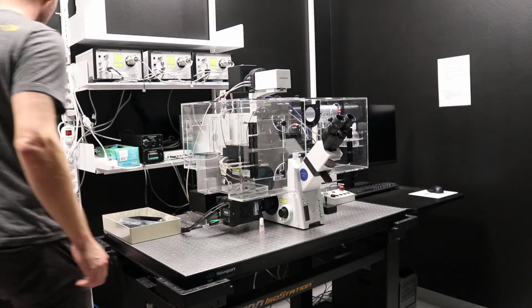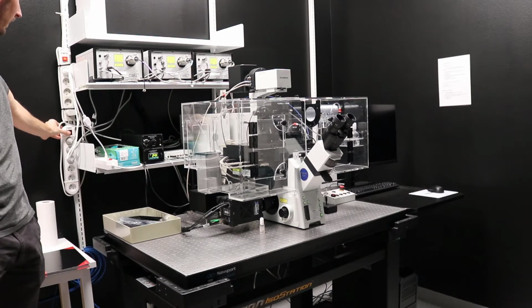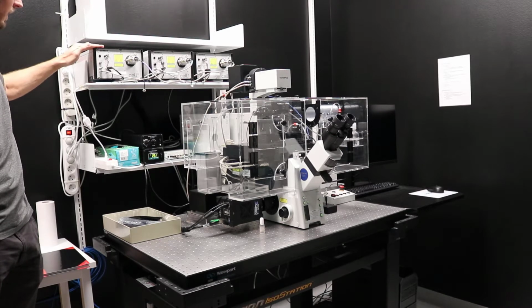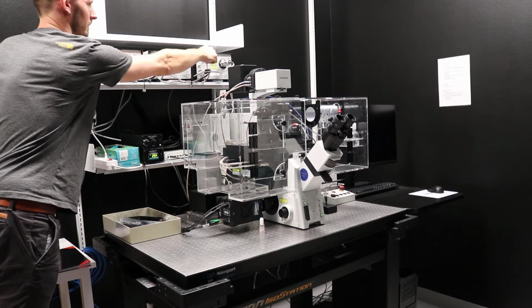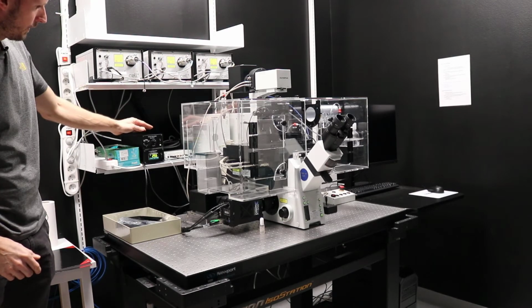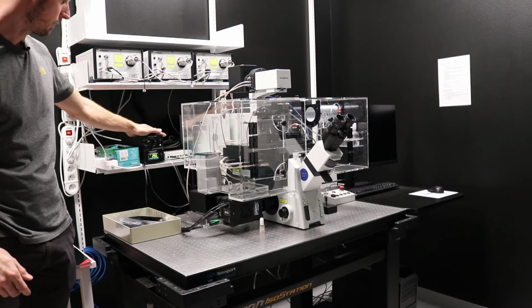You need to power it on, and if you're only using it as a wide field, then you only press the first power button up here. If you're going to use the lasers, then you turn on the TIRF. And the TIRF just means that you are turning on these 3 lasers, and for that you also need to toggle the switches here, so the keys. So everything is powered on. If you need temperature control and CO2 control, then you control it over here, which is also turned on in this case. If you don't need it, please turn it off.